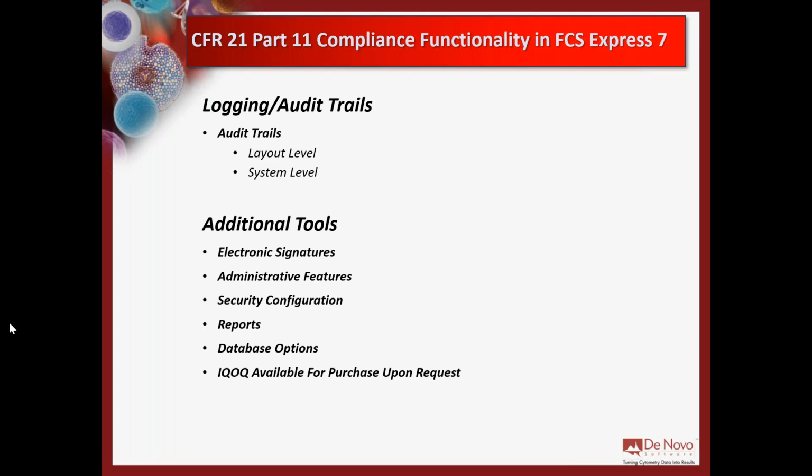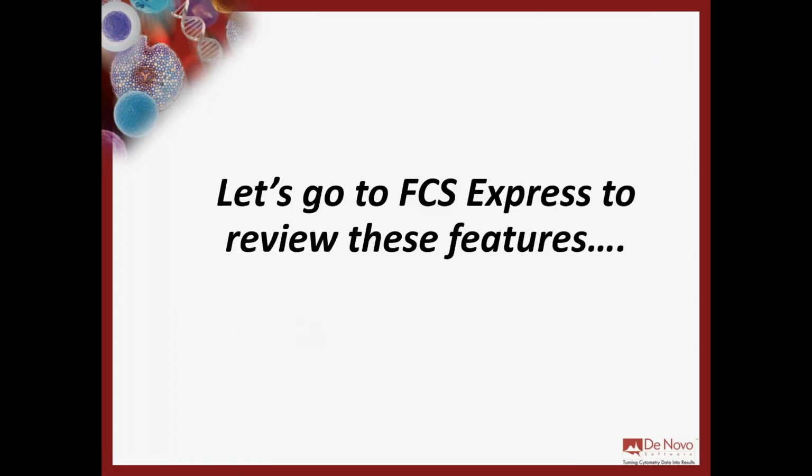And I think the last thing before we jump into some data is also that we have IQ OQ available for purchase upon request. So if you do want to run, in addition to logging and security, a full review of FCS Express with an IQ OQ, you can contact our team and we'll be able to help you out with that. So as I say here, let's jump to FCS Express to review some of this functionality that we talked about.